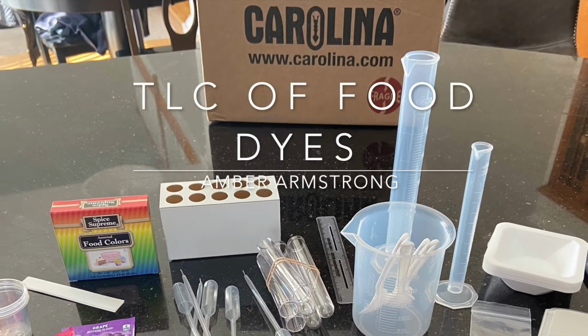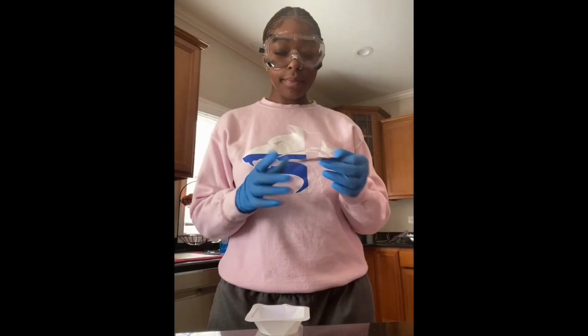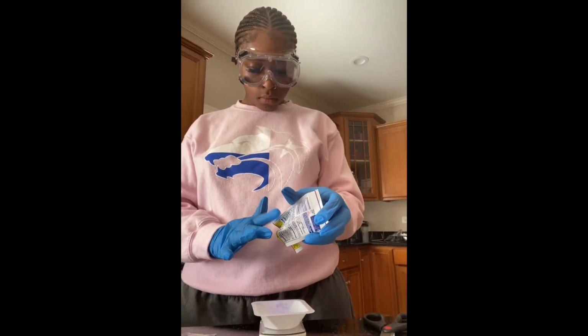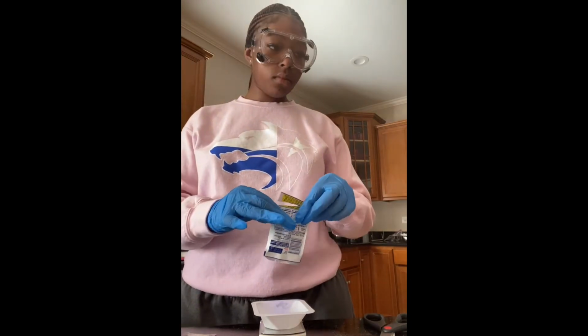Everyone. My name is Amber Armstrong, and today I will be performing my favorite lab of the semester, TLC of food dyes. So first, I want to start off by saying this lab required a lot of prepping, and right now I am going to prep the Kool-Aid samples.